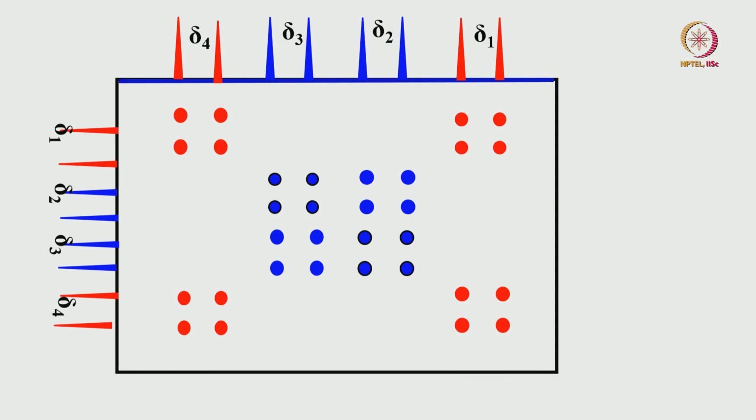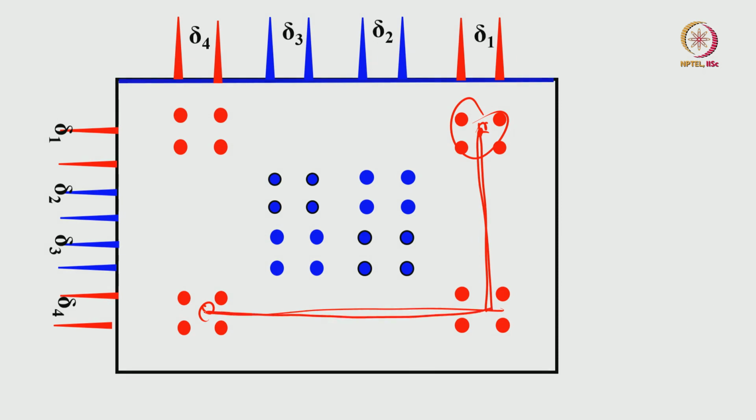On the other hand, if I get a spectrum like this, it is another interesting thing. Now from 1 come down, you get a cross peak, go horizontally here, you get a diagonal. So when the cross peaks go vertically up and horizontally, if you hit two diagonal peaks, then they are coupled. That is the assumption. You have to understand that. So if one starts with one diagonal, comes vertically, comes horizontally, you meet another diagonal, and this cross peak tells me these two diagonal peaks are coupled.